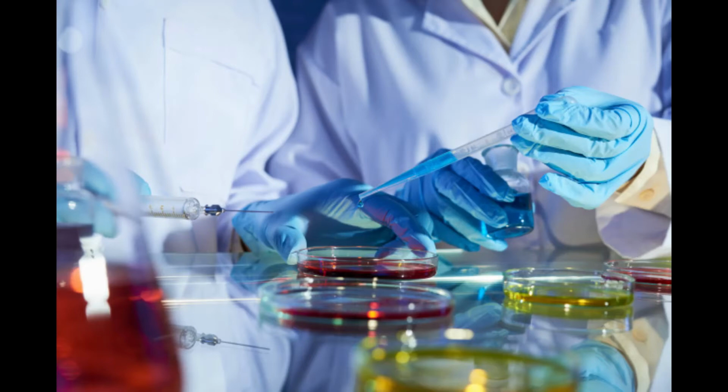So let's talk about how to do that. Serratia is biosafety level 1, so we are going to use our metal inoculating loops and needles. So I'm going to grab, so these are your metal ones, right? Not the disposable ones. We don't need those for now. But some of these you're going to use a loop for, and some of them you're going to use an inoculating needle. So the needle is the one that does not have the loop on the end, and the inoculating loop is the one with the loop on the end.